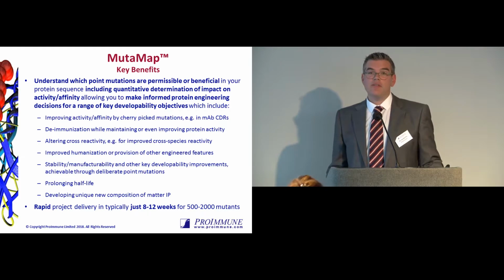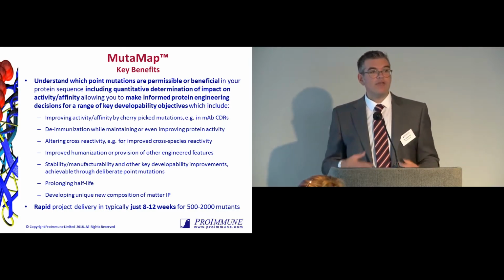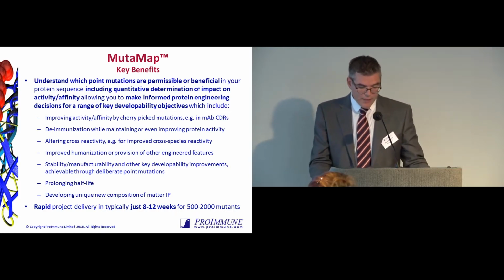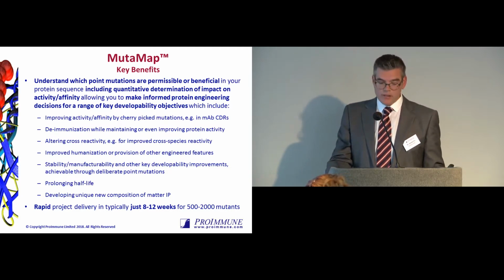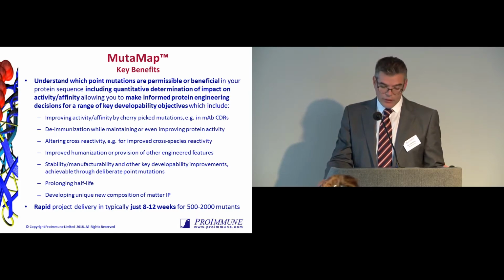So it means you don't have to do one assay, then another assay, and then another assay. You don't have time for that. You really want to sometimes put all these different assays together. It means that we can alter cross-reactivity. Maybe you have a molecule which is at the moment not suitable for doing some of the development work. You might want to make sure that it's appropriate for use in some of the animal models that you're using. That can also be used for that.